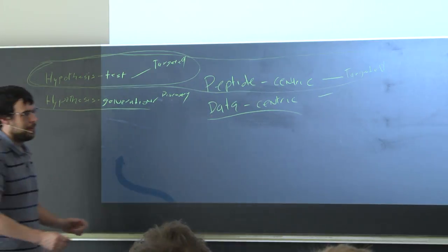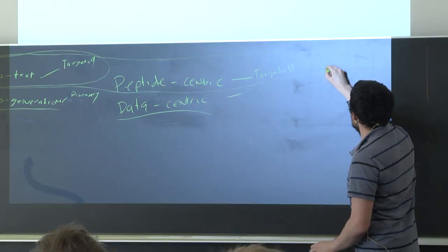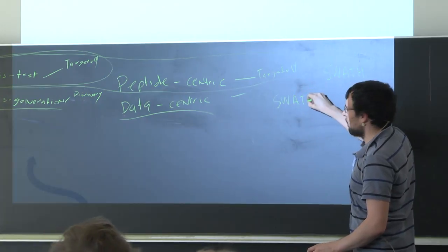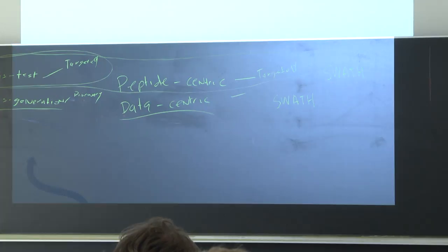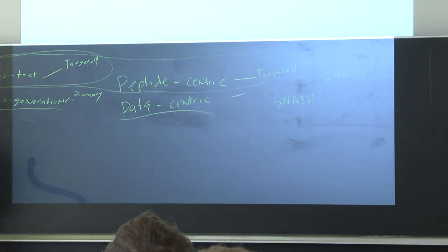Yeah, so an important thing as a follow-up with Brandon is that, for example, you can have swath here and also swath here. This depends on how you analyze the data. So saying that swath acquisition is targeted proteomics is not so clear for everyone. You can put swath there also?